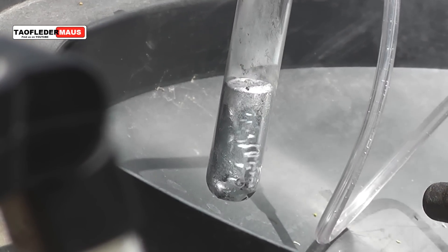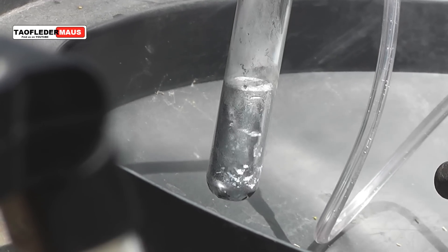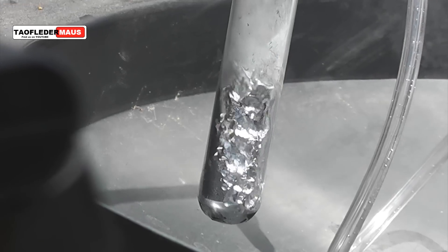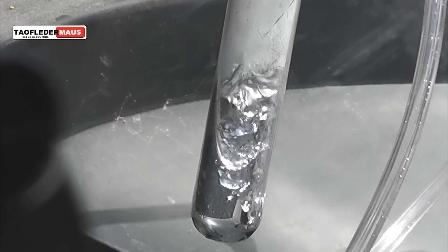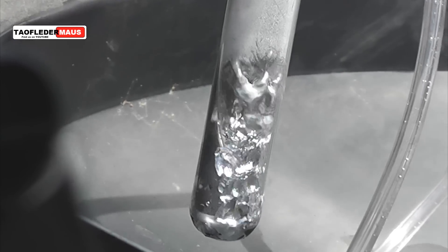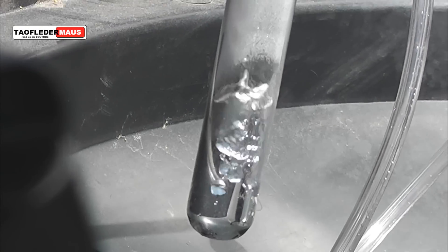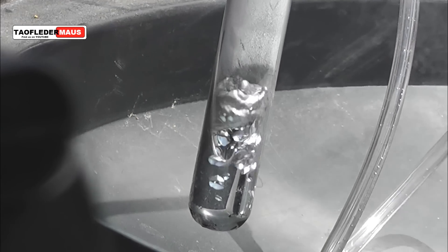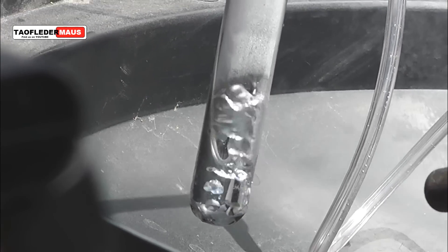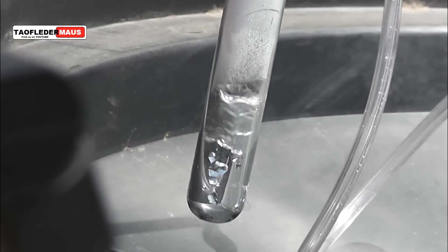I have boiled mercury before, but I wanted to film it in slow motion because it boils so rapidly and so violently — a lot of droplets — and I wanted to see what it looked like. What looks like water vapor or water condensing on the upper surface of the test tube is actually mercury vapor condensing; it's just very, very tiny droplets of mercury.